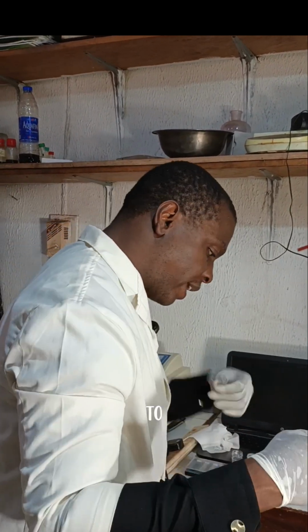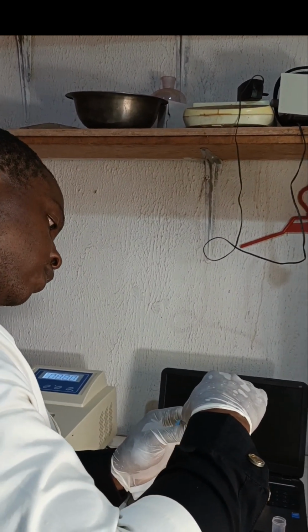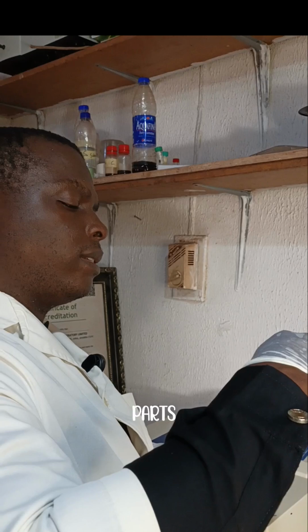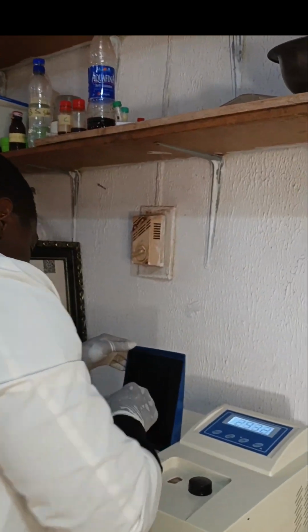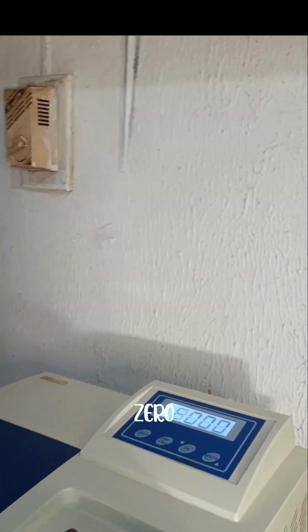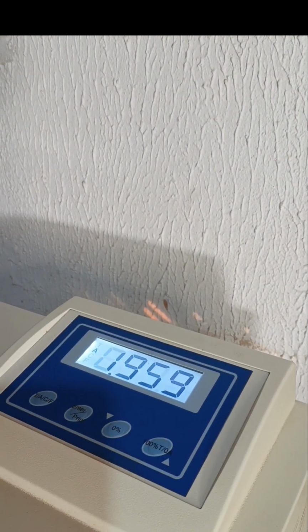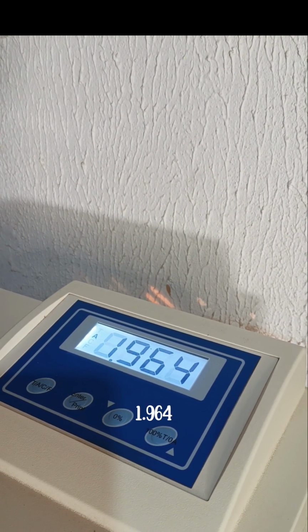Then the next will be to add 20 parts per million. Still remember that you have to clear the light parts, make it free. So as you can see, the machine is at 0. So once we change the cuvette to where the sample is, at 20 ppm, we got it to be 1.964.